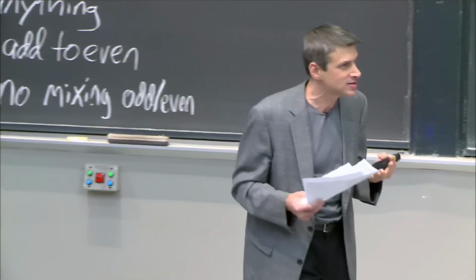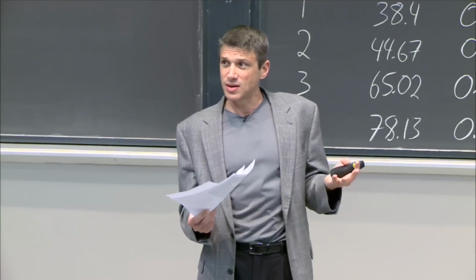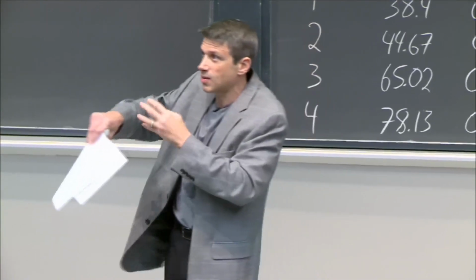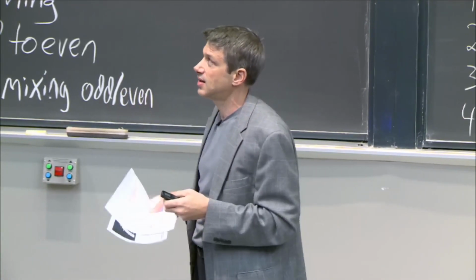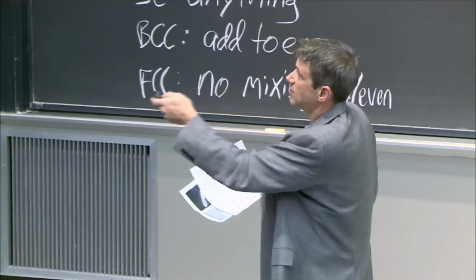Those are hydrogen bonds. They're kind of strong, but they're not too strong. There's a lot of ways that those water molecules could form a solid, and they do, 17 to date and counting. But see, and this tells you which one you have.